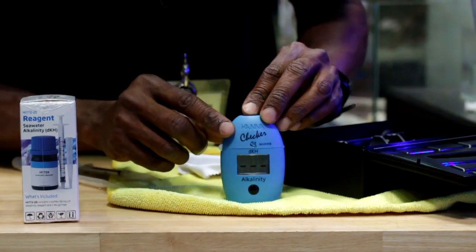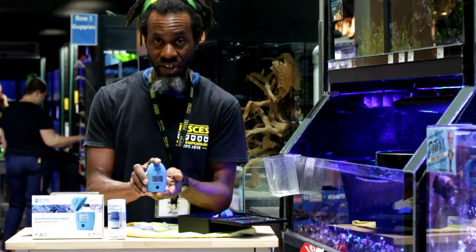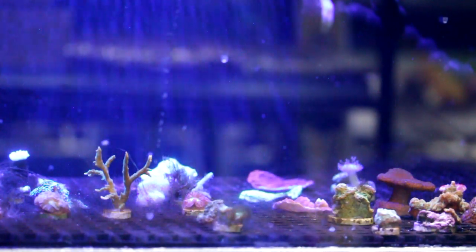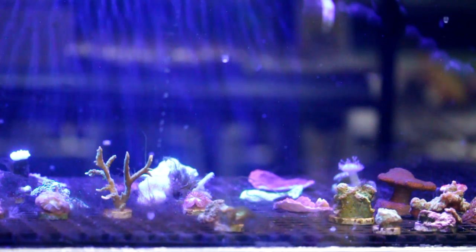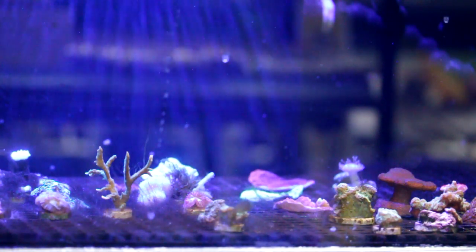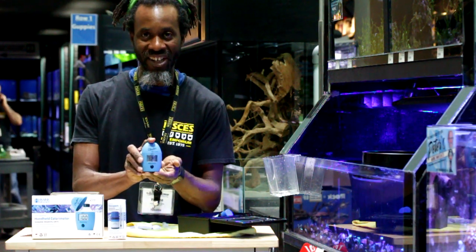This tank is reading 11.9 dKH — really on the high side, but that's within our range. This is our frag tank because we're really trying to push the growth and calcification of the frags, so we keep the alkalinity on the higher side so they're going to be growing a lot better. And it's as simple as that — that's our reading from the Hanna checker.